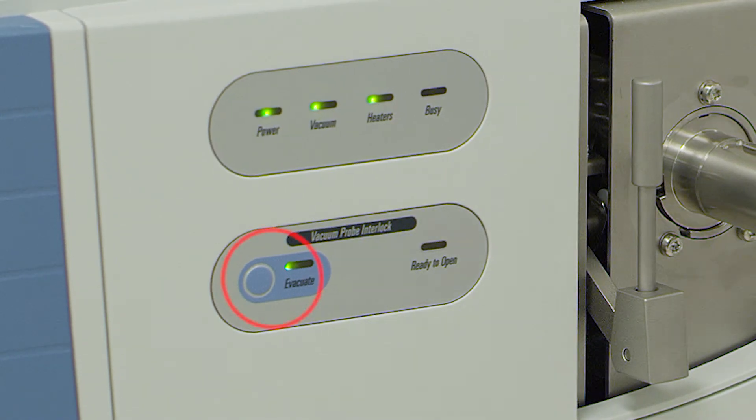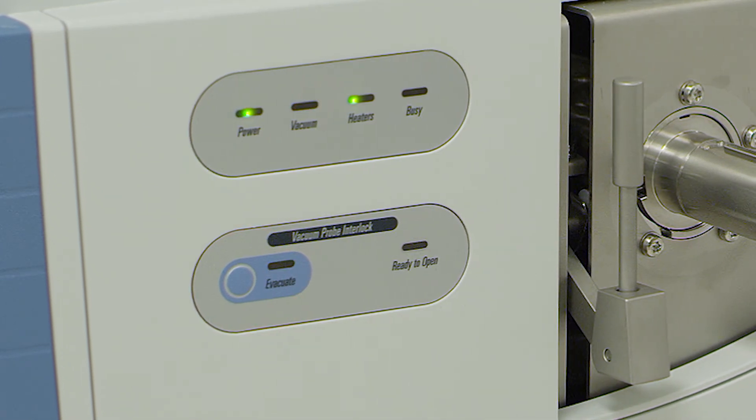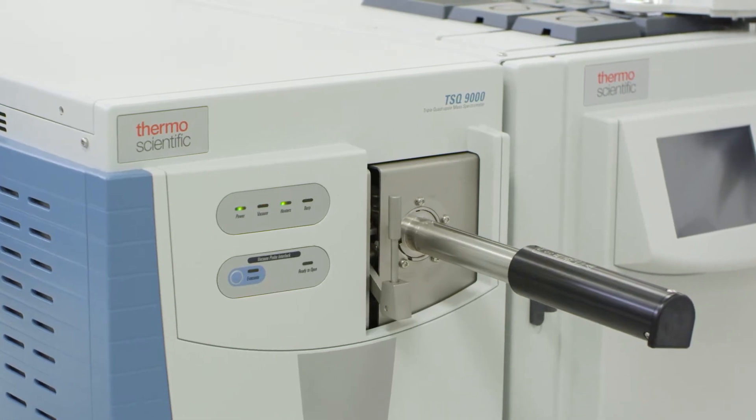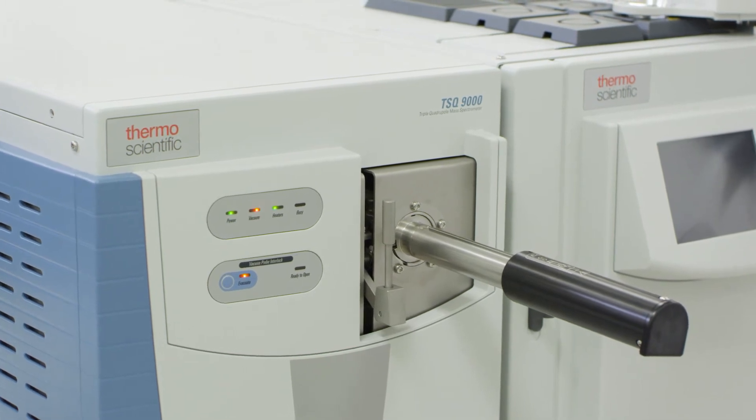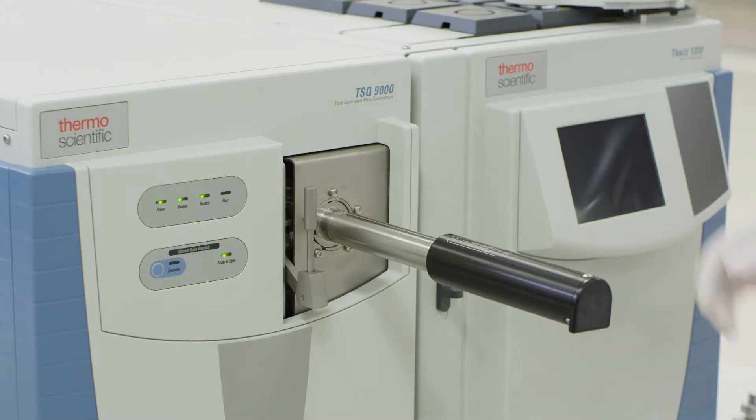Locate and press the evacuate button on the front of the mass spectrometer. The lights on the interface will turn red to indicate that the interlock is evacuating. Once the green light turns on indicating it is safe to open, you may now proceed.